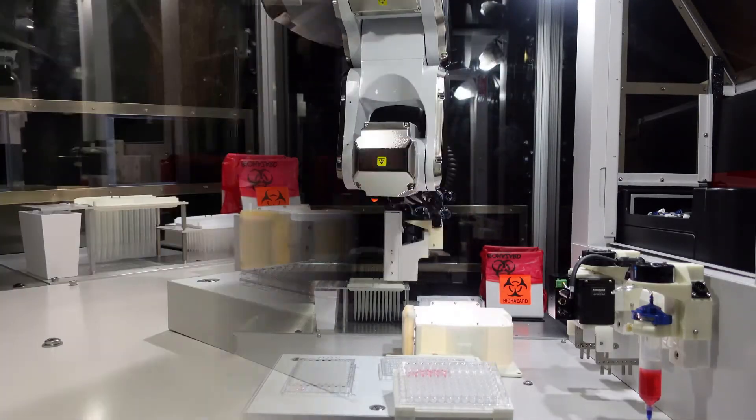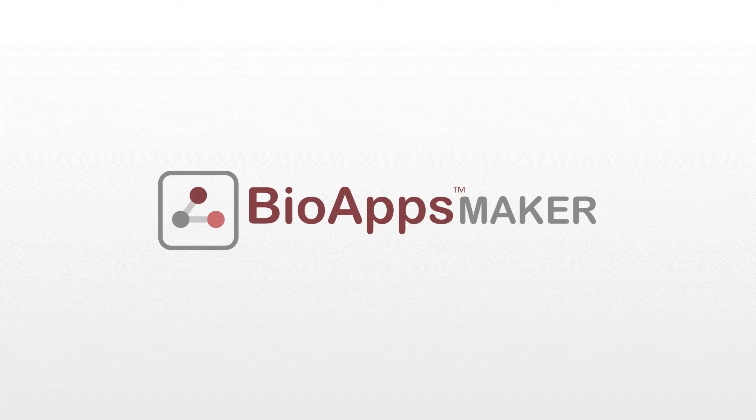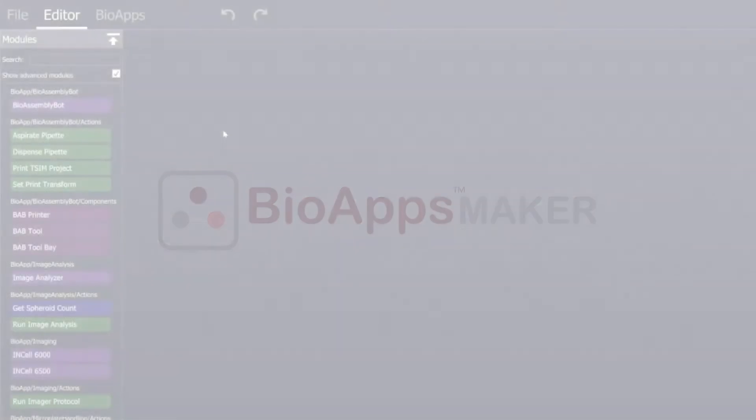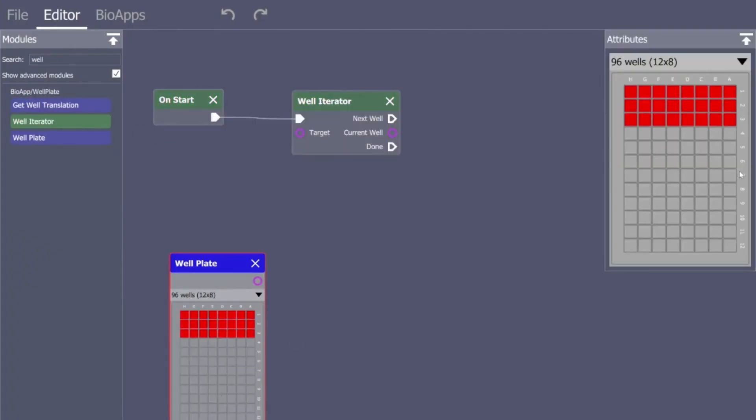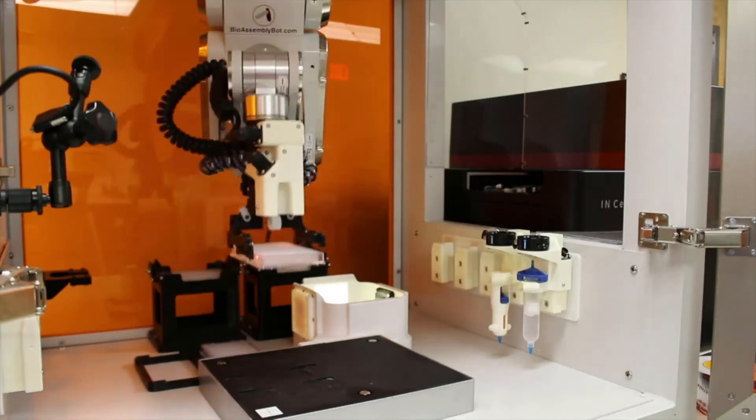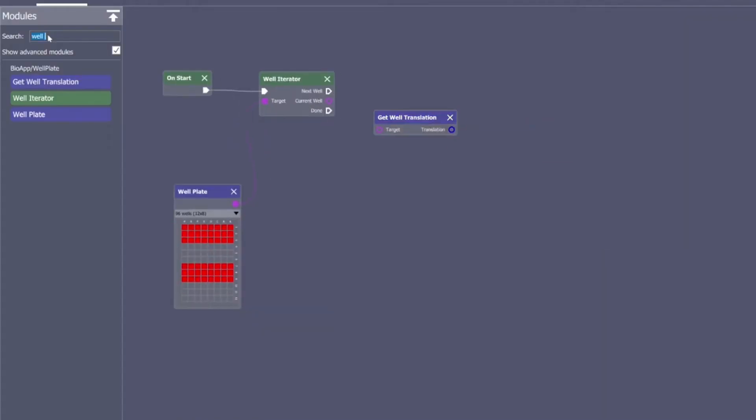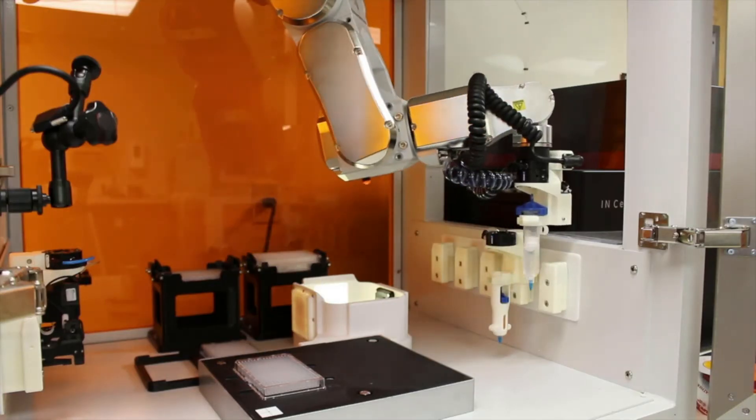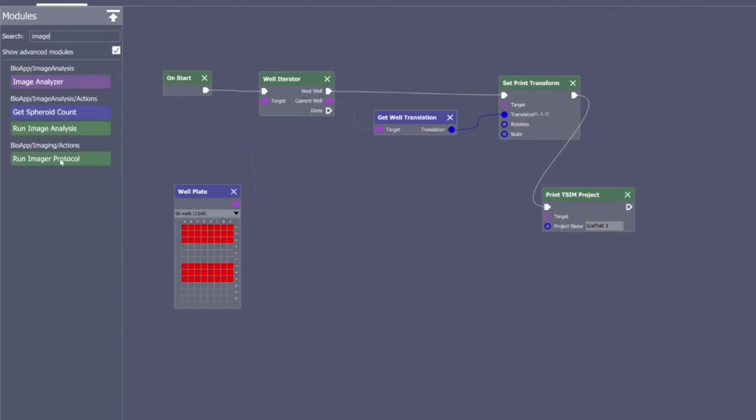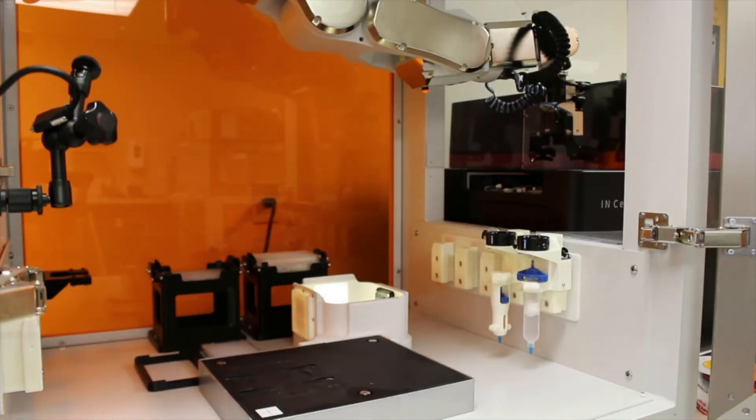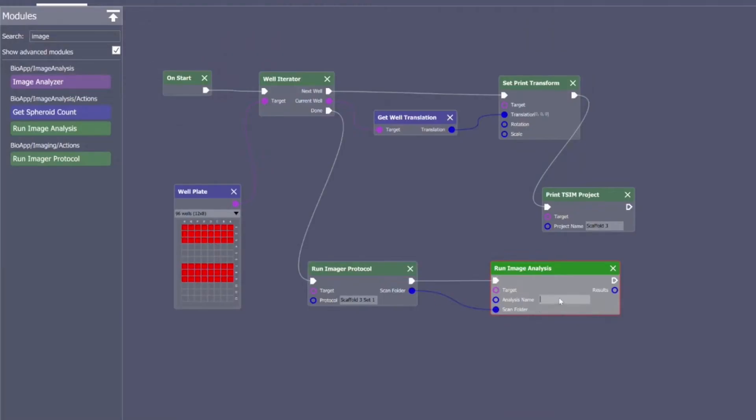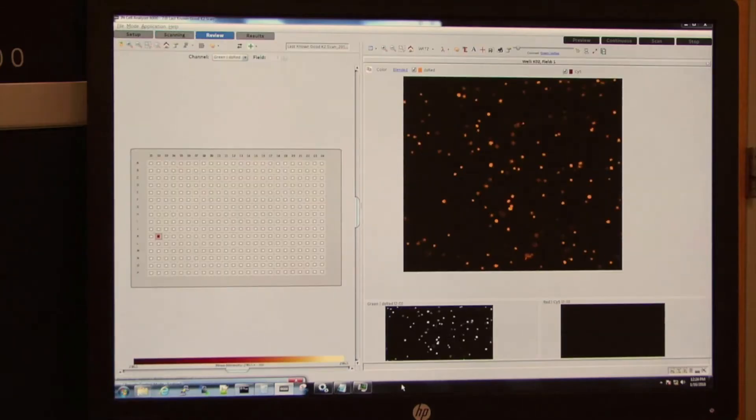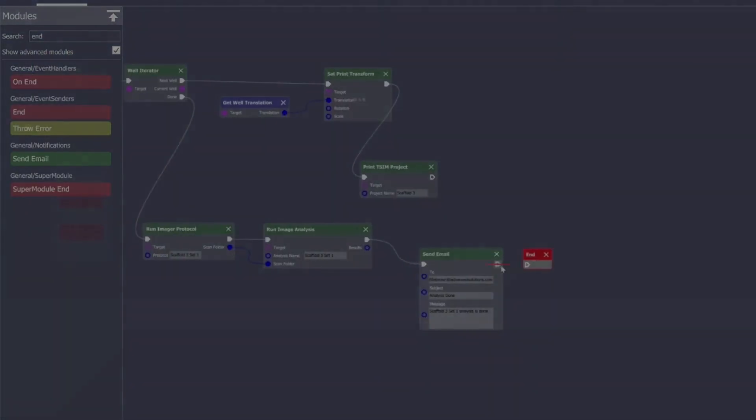Not a programmer? No problem. BioApps Maker is an intuitive drag-and-drop workflow tool that allows you to easily translate your biology recipe into a set of instructions that BAB can understand and turn into automated workflow results. The team at Advanced Solutions Life Sciences and our community of clients around the world are building BioApps for 3D biology that work like apps on your smartphone.